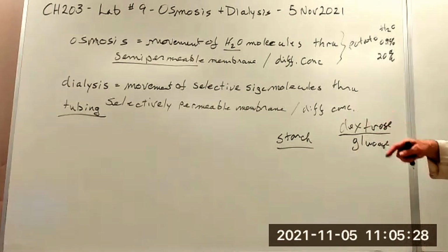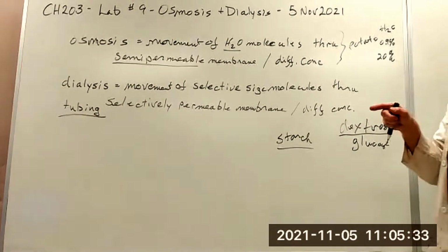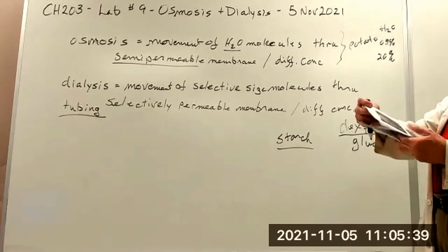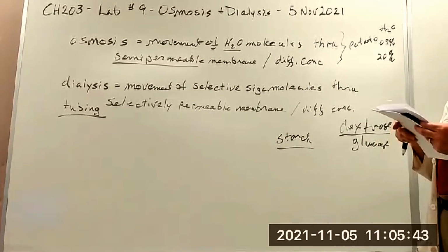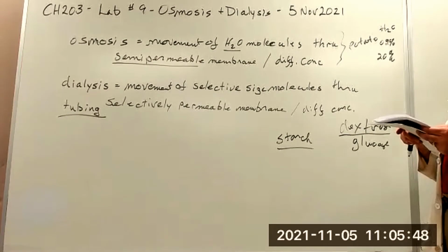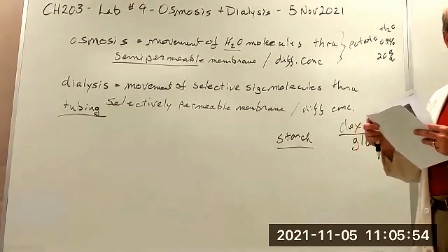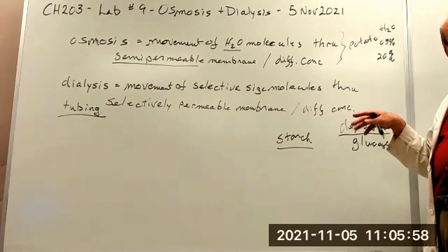So our testing is, you're going to test the solution inside the tubing and the solution outside the tubing, I think. Let's see. No, just outside. We don't need to test inside because we know it's already there, because we put it there. So you just test the solution outside the tubing. See which one moved through the tubing.